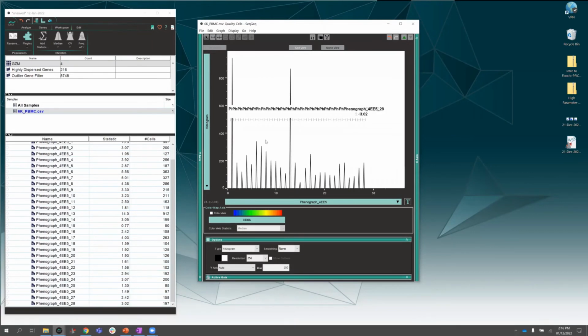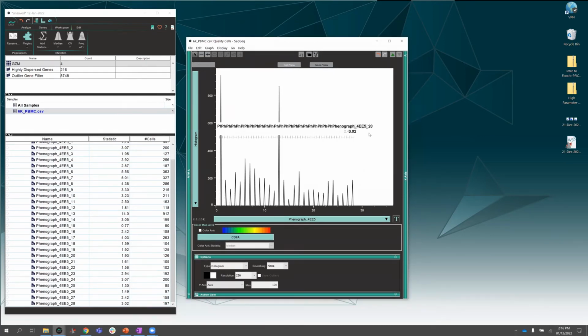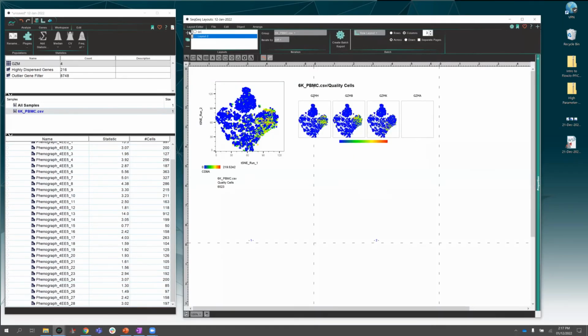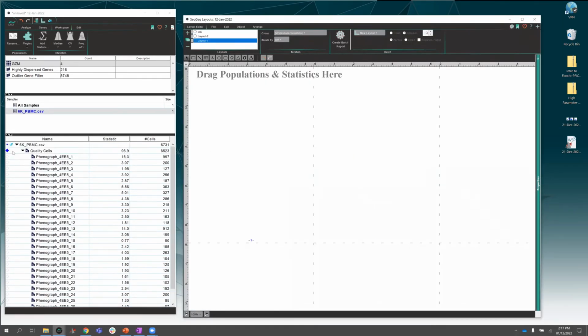So it tells me that each of these are unique in some way, and that's why they've been grouped together. But we ultimately don't really know what they are or how they're different from one another, at least yet. Okay? So if we want to just do some visualizations, right? Just play around in the layout editor.